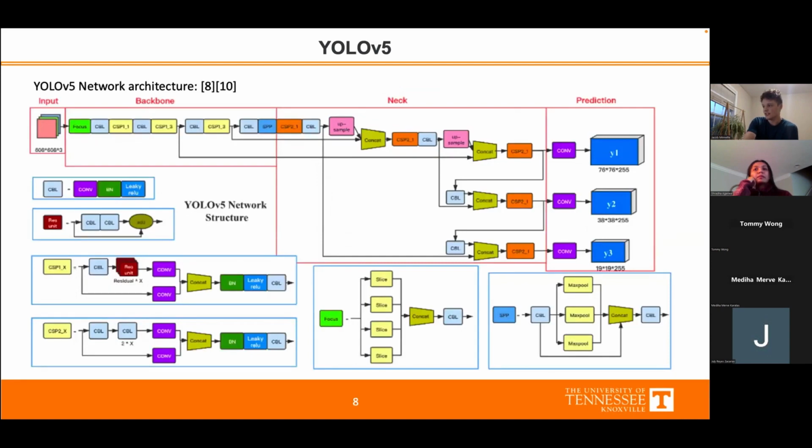And then this is the actual network structure for YOLO V5 extra large, which certainly seems that way. Just looking at this all, I didn't have a chance to actually break down cell by cell what each component is, but the framework is much the same. You have your activation function, which is leaky ReLU, used for every single convolutional layer.